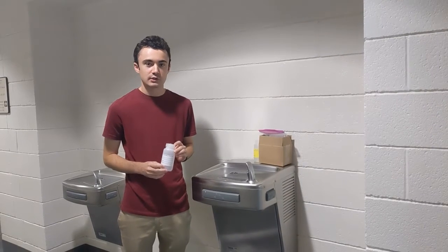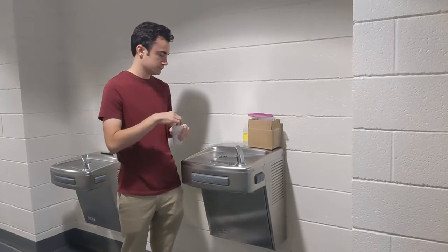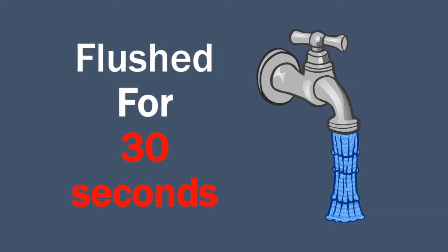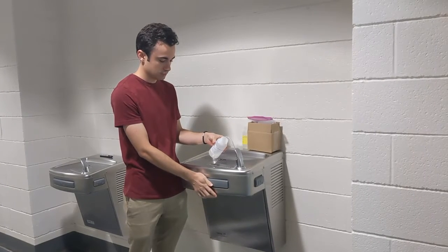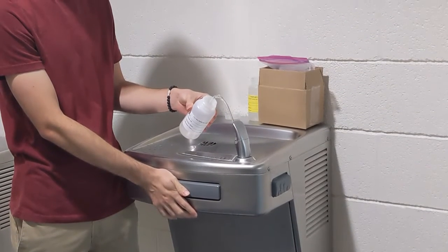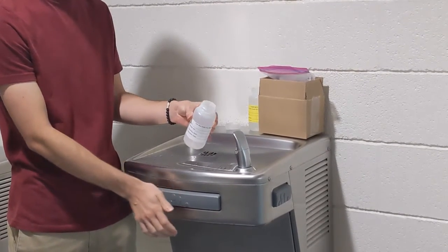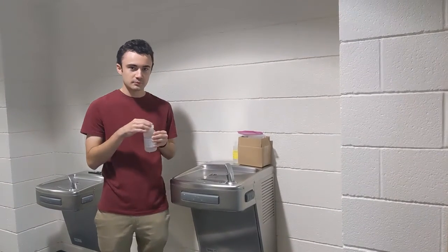After 30 seconds of flushing, you will sample the bottle with the white label. Just as with the other bottle, fill it to the neckline and close the cap.